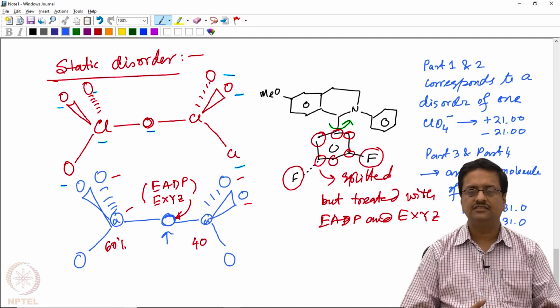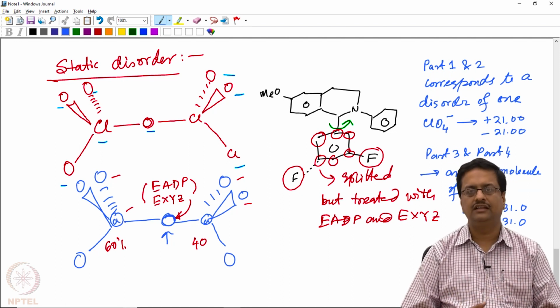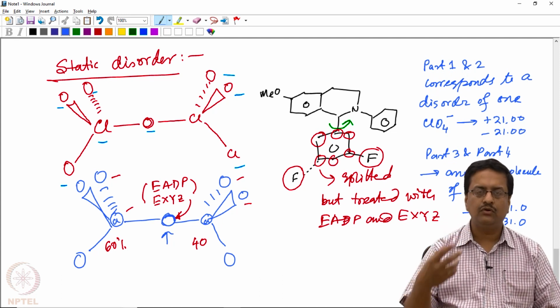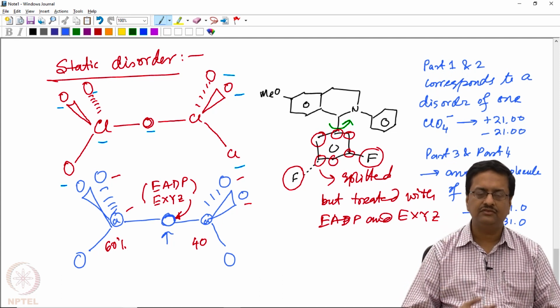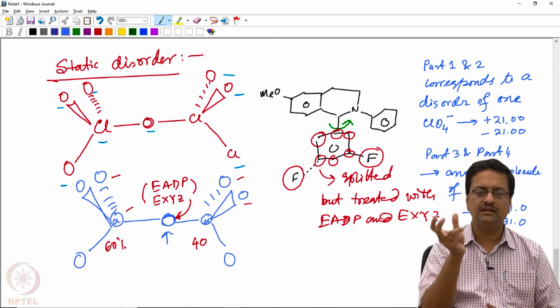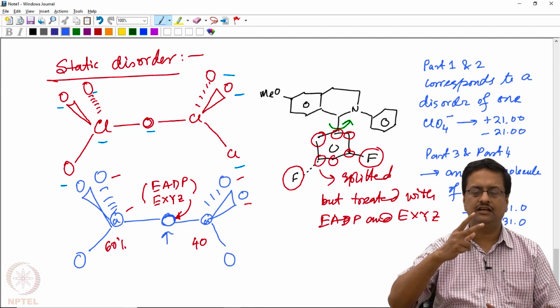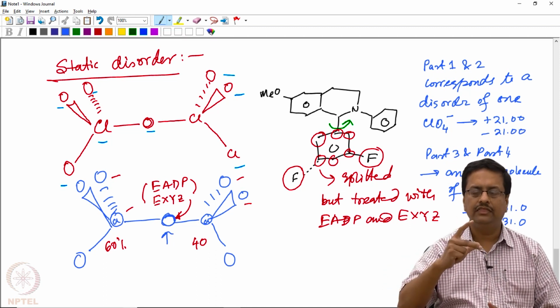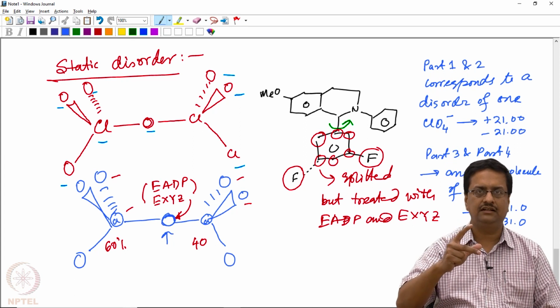To avoid such a situation, we always recommend that you take a crystal at room temperature and slowly cool the crystal to 100 K, so that you allow all the molecules to slowly reduce their temperature and refine their thermal vibrations, and then come to a thermal minima and then fix at one place at 100 K.